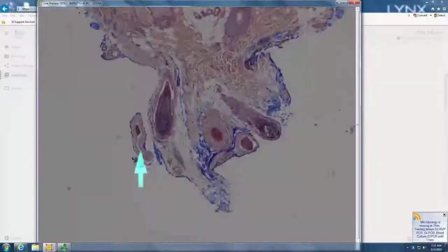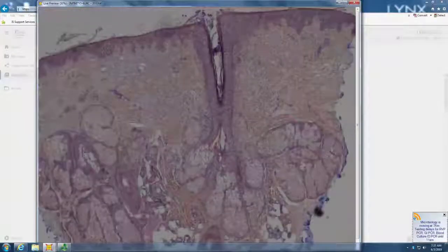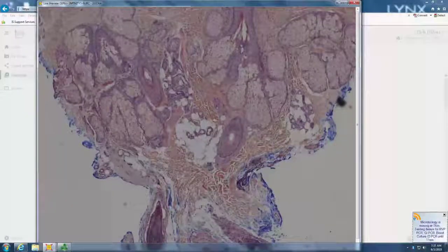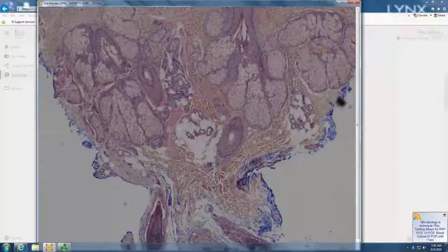How about the hairs? Big strapping hairs or kind of small hairs? Very small. And if this were a scalp, what do you think about the hair diameter? They're pretty small, so miniaturization. So name 3 scalp conditions that give you miniaturization of hairs?